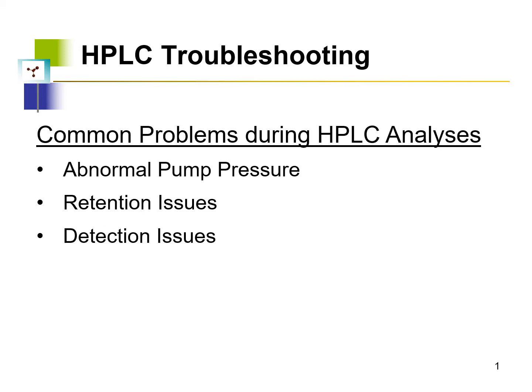In this next section of the HPLC topic, we're going to talk about some HPLC troubleshooting — common problems that we tend to see during HPLC analyses, what could be the causes of these problems, and how we go about solving them. Three of the most common problems are abnormal pump pressure, retention issues such as shifting of peaks where retention times start changing, and detection issues where we are not able to detect expected peaks or peaks may be particularly low or high.